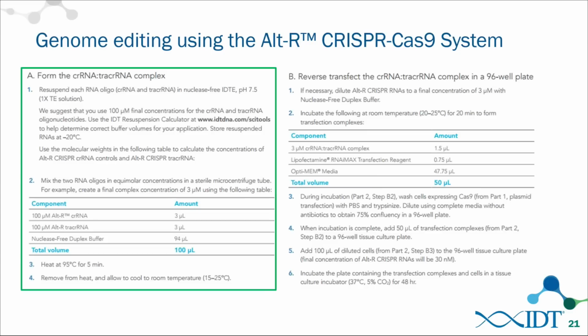which really speaks to the point that these are an evolving set of experimental protocols that, based on your feedback, based on customer feedback, and based on things that we continue to try to improve in our lab, are a little bit dynamic. But these are, in fact, 2 bits of data that we just saw this morning from some experiments that don't necessarily call for the heat step or for using duplex buffer.